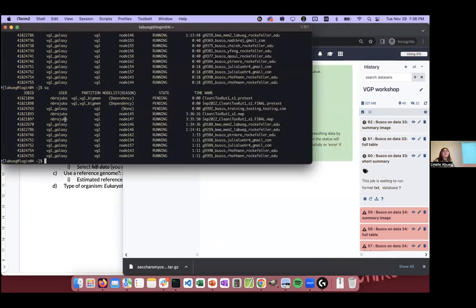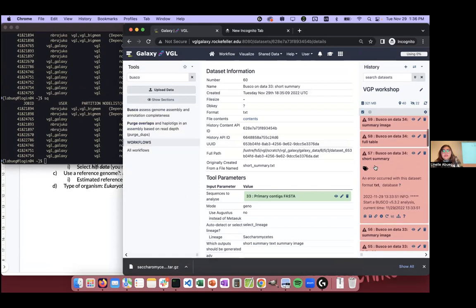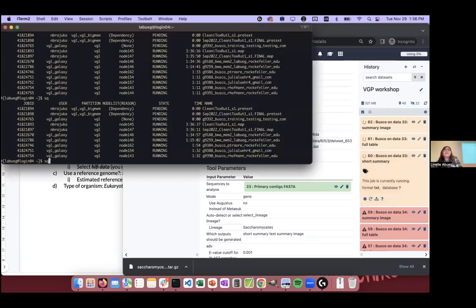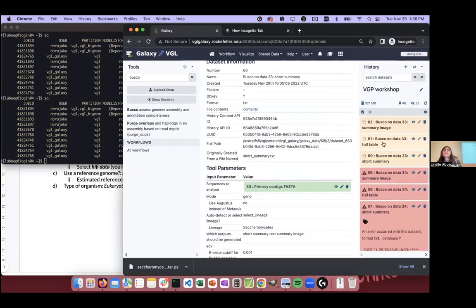It's waiting to run. I don't know if it's sending that yet, though. Mine just, on day 34, general analysis. Alternate works. I can't believe we DDoS the Busco.